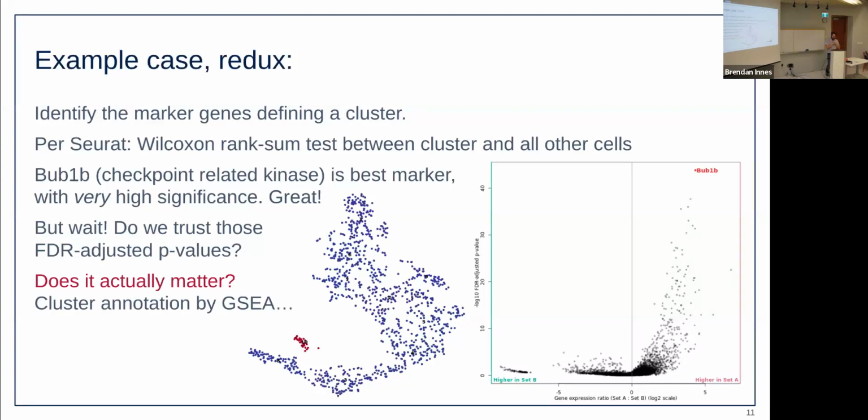And I don't actually know, but one of the things I always like to look at in these is the volcano plot, because that's effect size versus p-value. And if the volcano plot has a nice line there, the tighter that is, the more I believe it. Once you start getting things where it's a big effect size, low p-value, I'm like, what is going on with this data? Something weird is happening. It's the test. Something strange is going on, right?